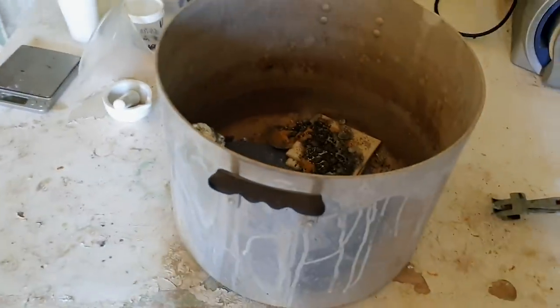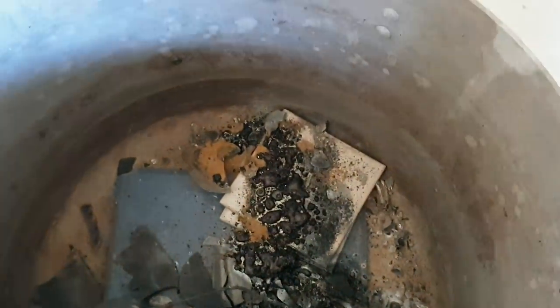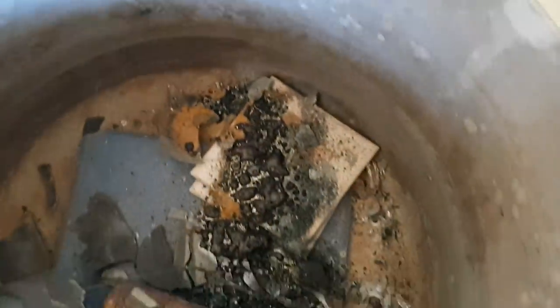So hot. Straight away we can see there's some unreacted mix in there, which is always disappointing because that's immediately lost yield. Doesn't look like a whole heap, but you obviously want that to go to completion.